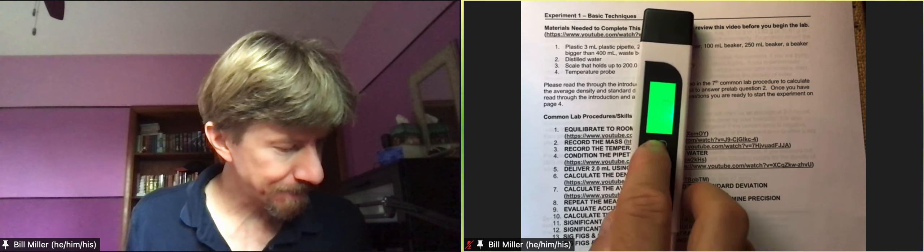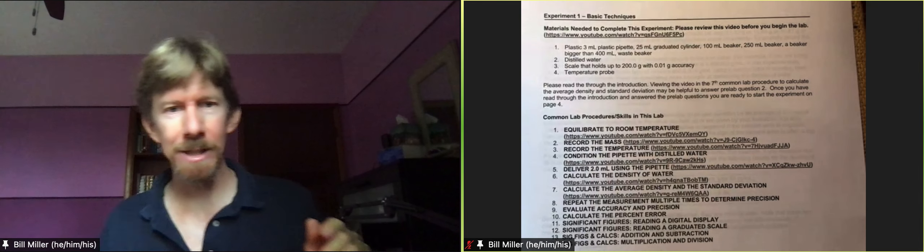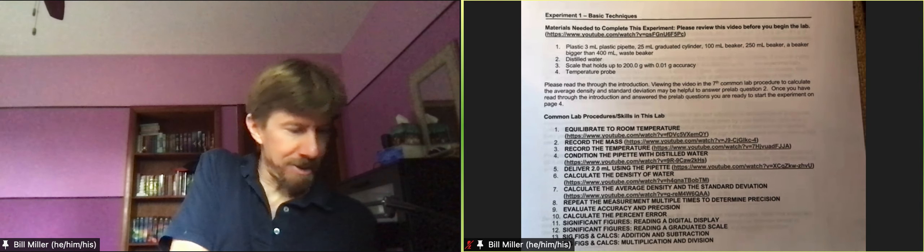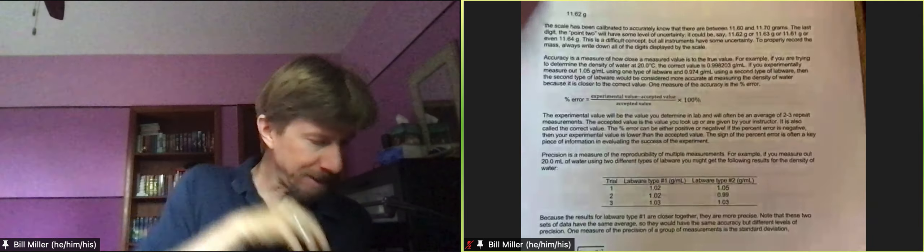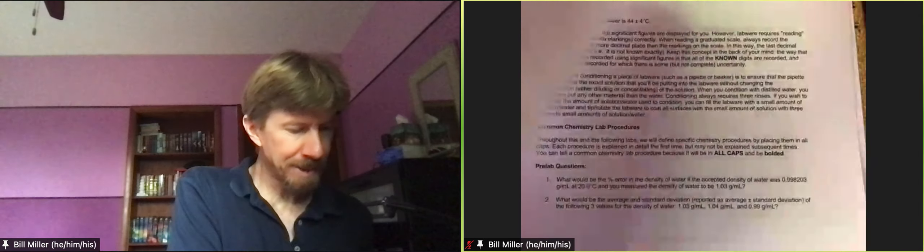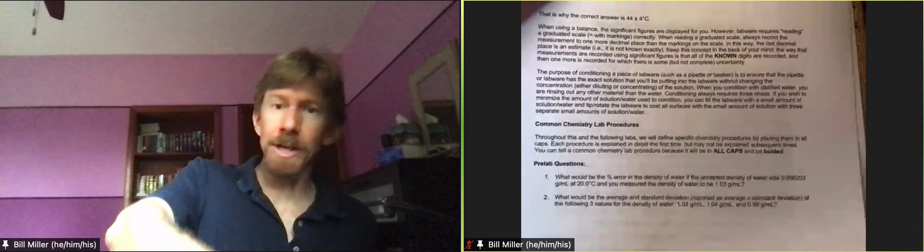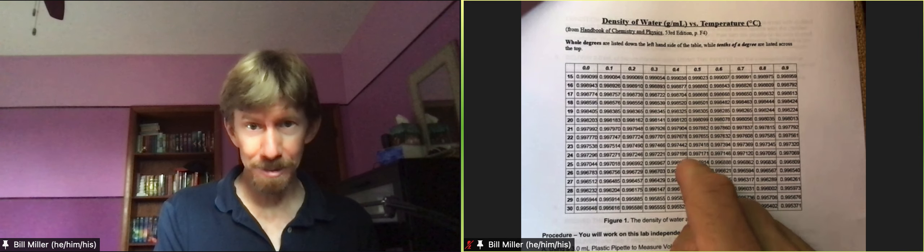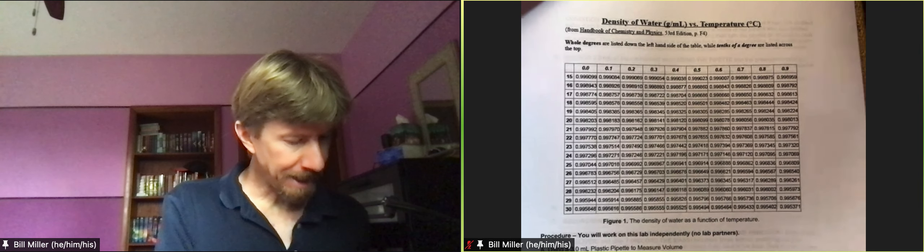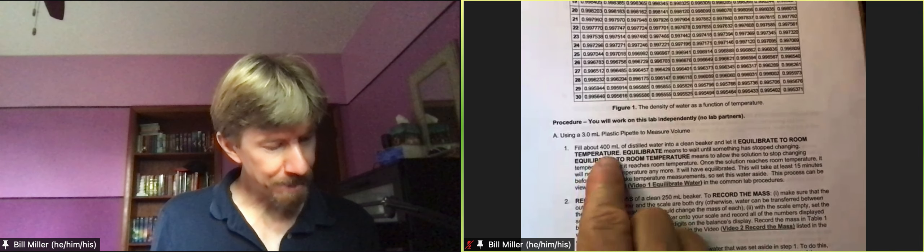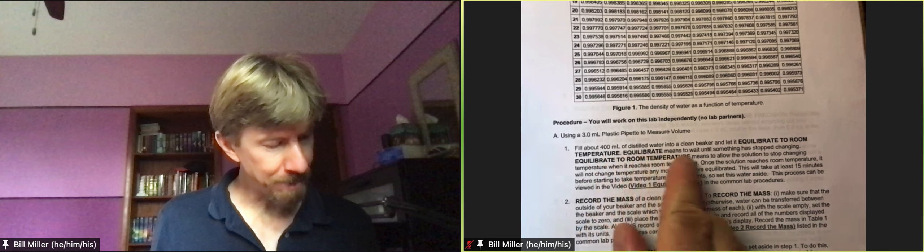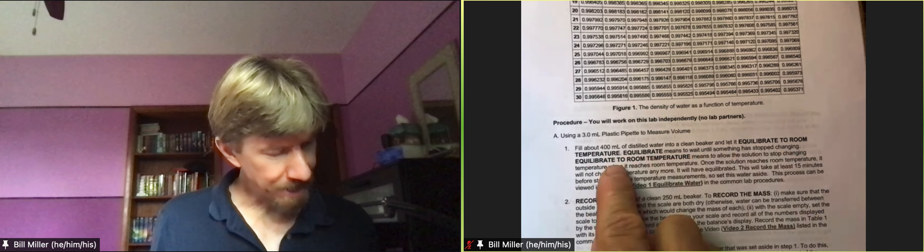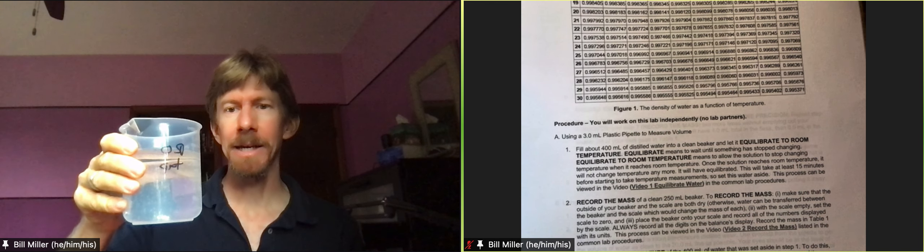All right let's turn that off for now, put it away. We have everything we need to do the experiment. Normally we read the introduction because it's got lots of good information in it including how to do a bunch of these calculations and examples. Your pre-lab questions you do them in your learning management system. We will come back to this table to get the density values for water at a specific temperature and here's our procedure. Our procedure says fill about 400 milliliters of distilled water into a clean beaker and let it equilibrate to room temperature.